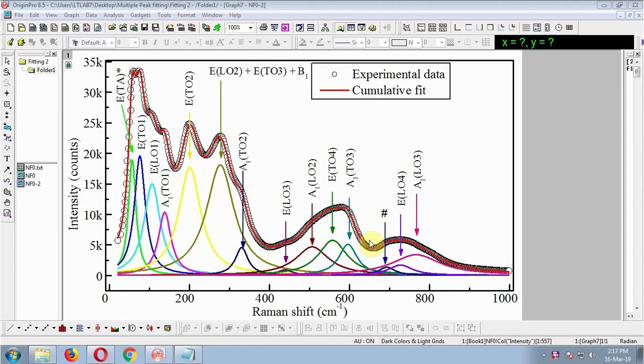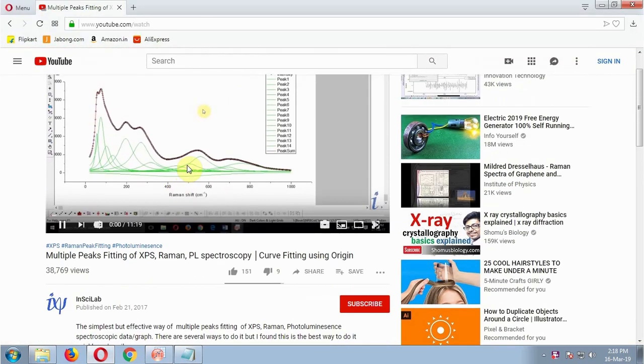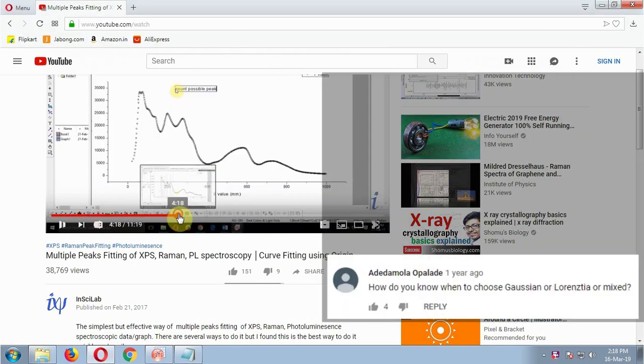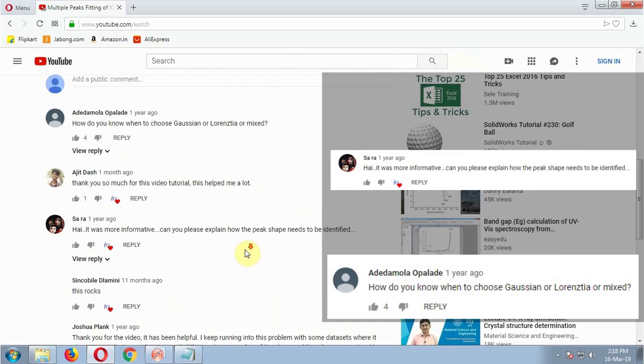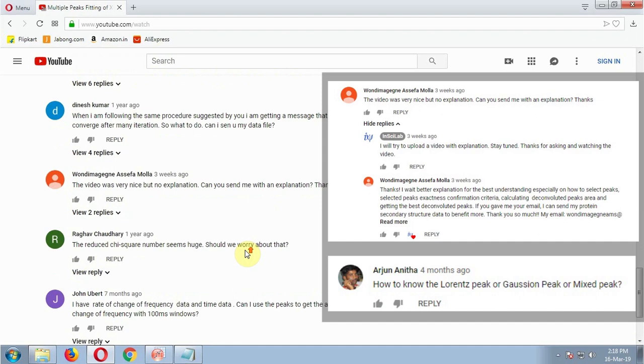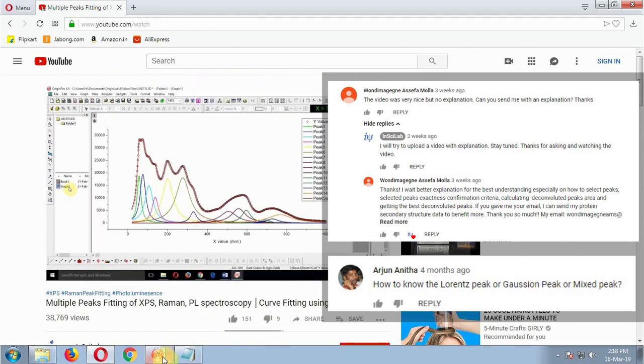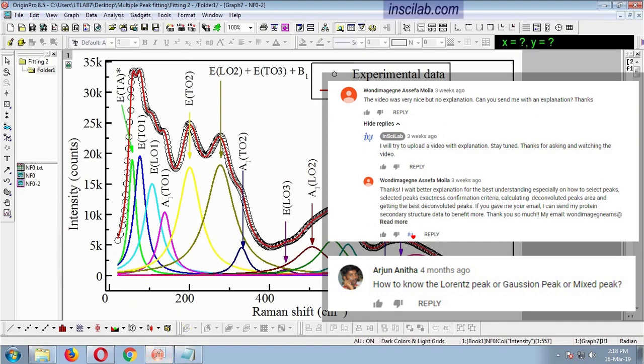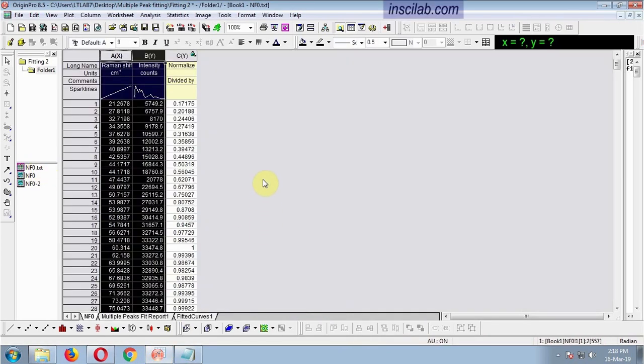This is a Raman spectrum. I have fitted it with 14 peaks. I will show how I did it. In a previous video, I showed how to do it. Many viewers asked for a similar video with explanation on several steps. Some of them also asked several questions. In this video, I will try to answer those questions and try to explain each step. Let's start from the beginning.